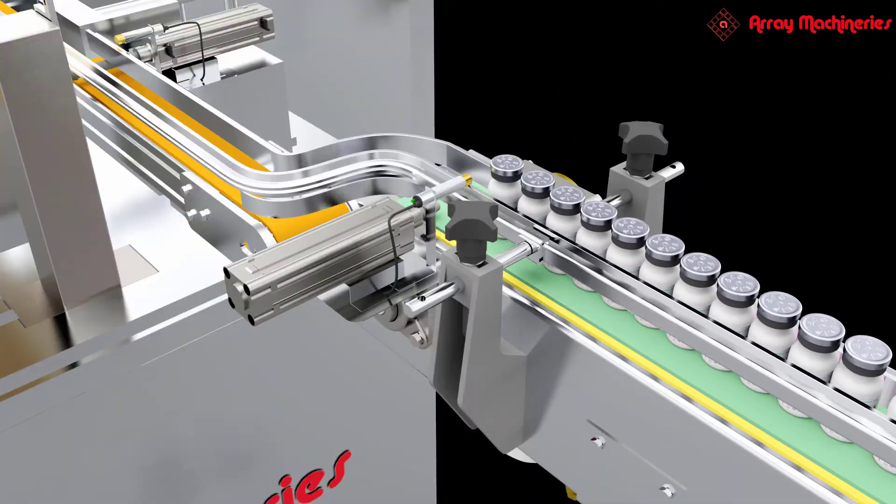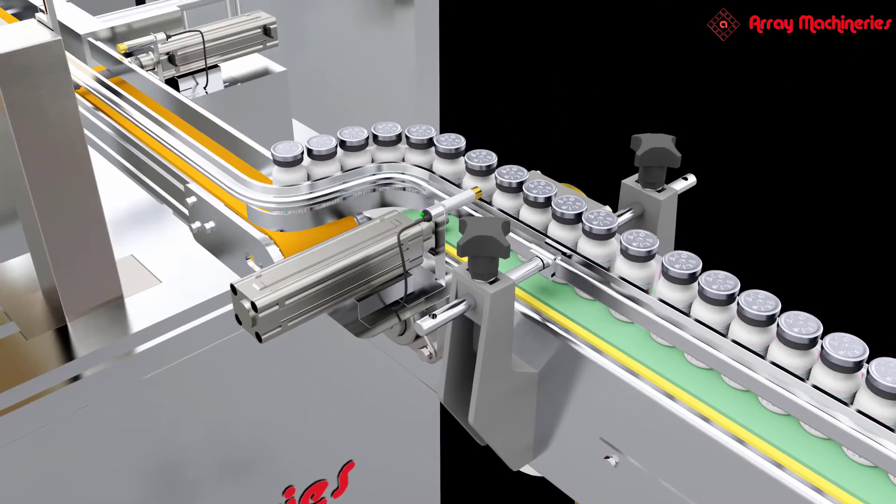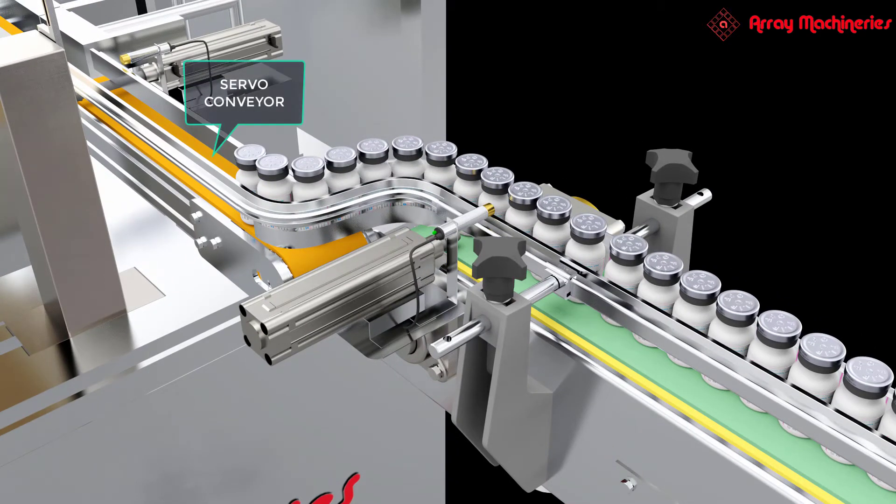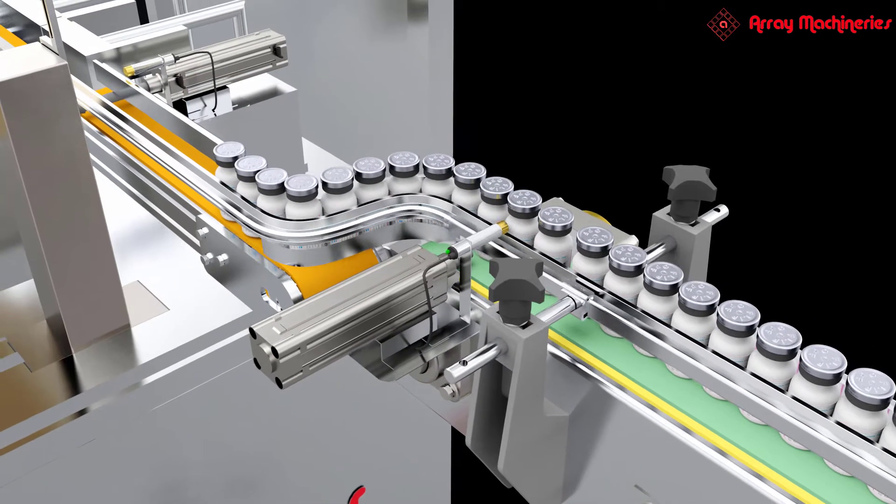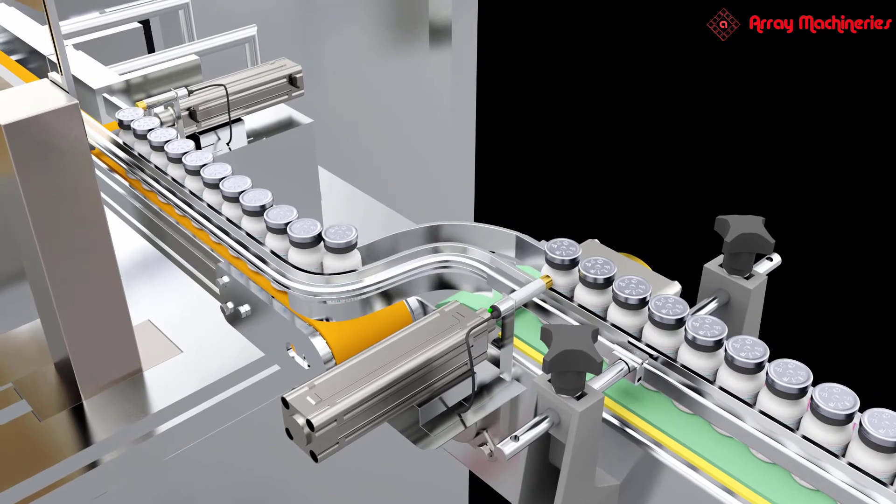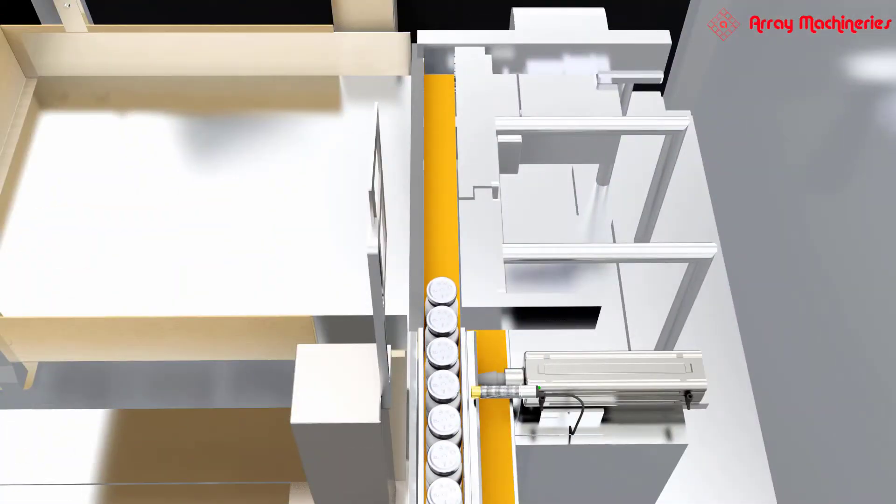Vials are conveyed from the continuous running conveyor to a servo conveyor. While the servo conveyor runs, sensor and stopper 1 let pass a definite number of vials to the servo conveyor. Sensor and stopper 2 let pass the vials through.